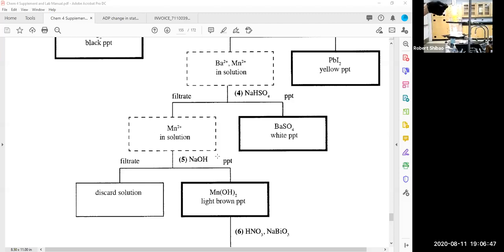And then what I'm going to do is I'm going to just put that back in here. I'm putting it back in here just to try to get it to coagulate. You know, that's one way. Or the other way I could try to do it is to cool it down.